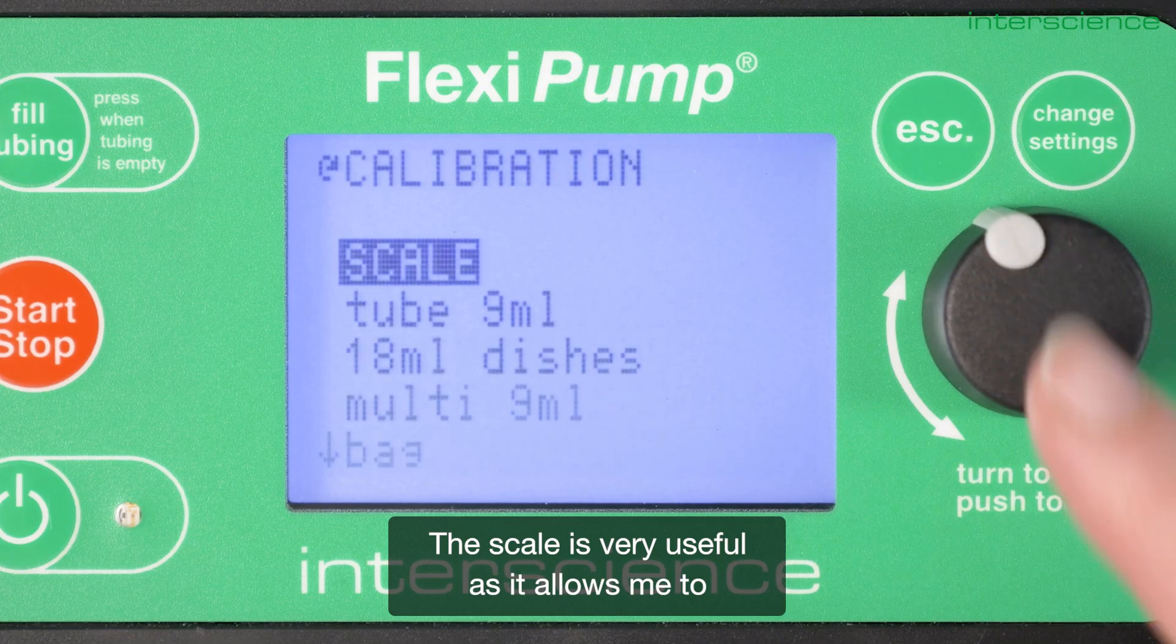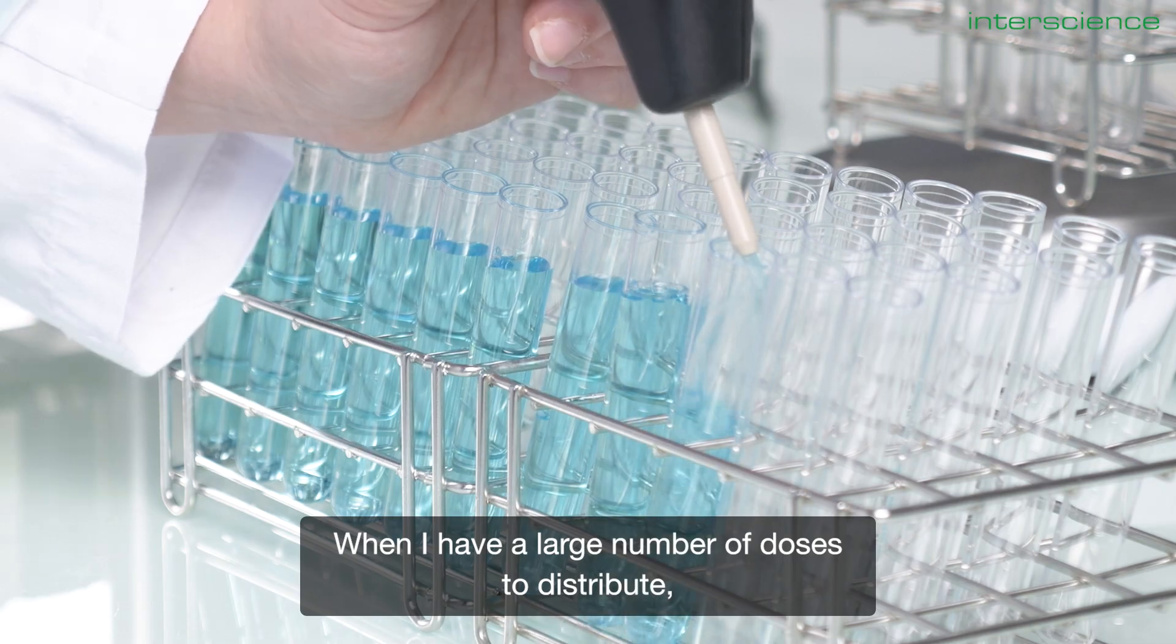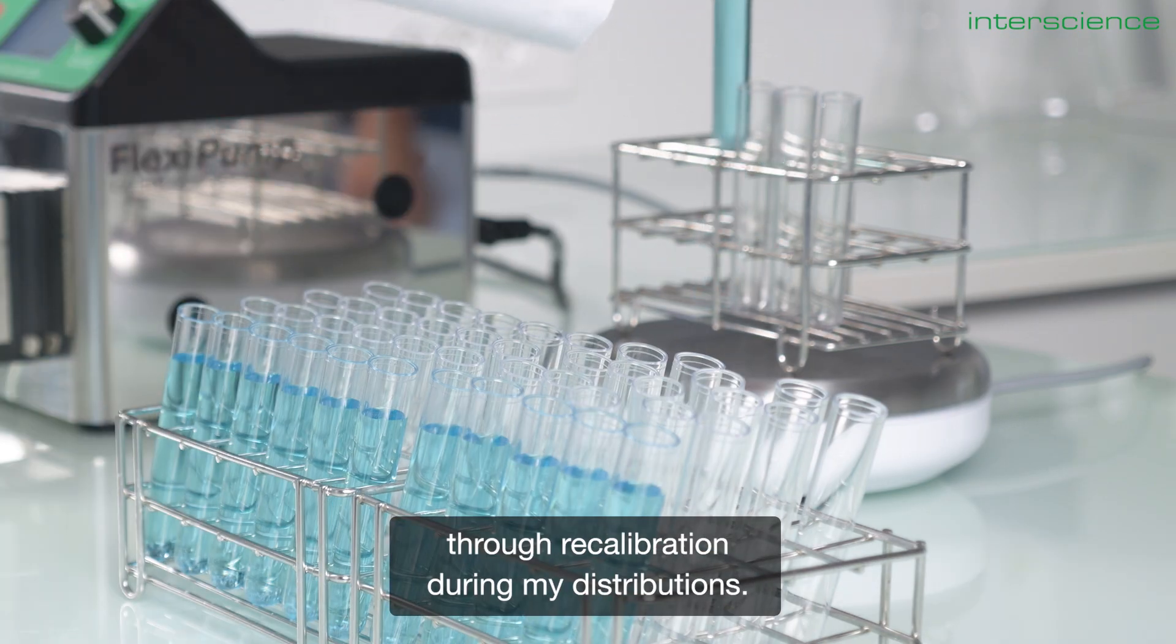The scale is very useful as it allows me to calibrate my distributions before each handling. When I have a large number of doses to distribute, the scale allows me to gain precision through recalibration during my distributions.